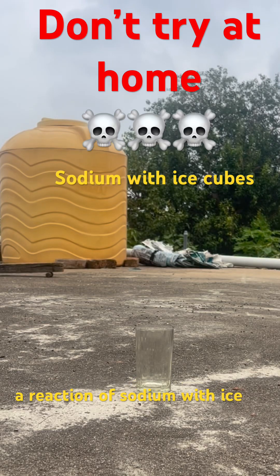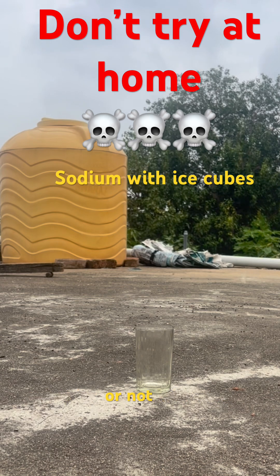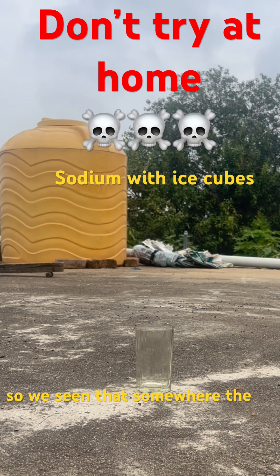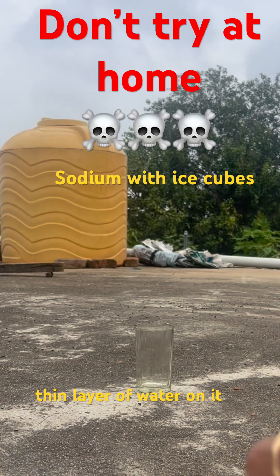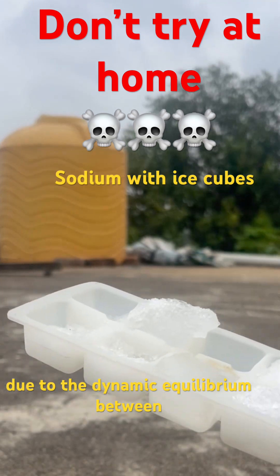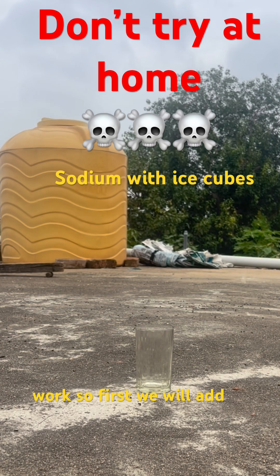Hello friends, today we are doing a reaction of sodium with ice cubes. Let's see if it will work or not. We can see that ice cubes have a thin layer of water on them due to the dynamic equilibrium between melting and freezing. Let's see how it will work.